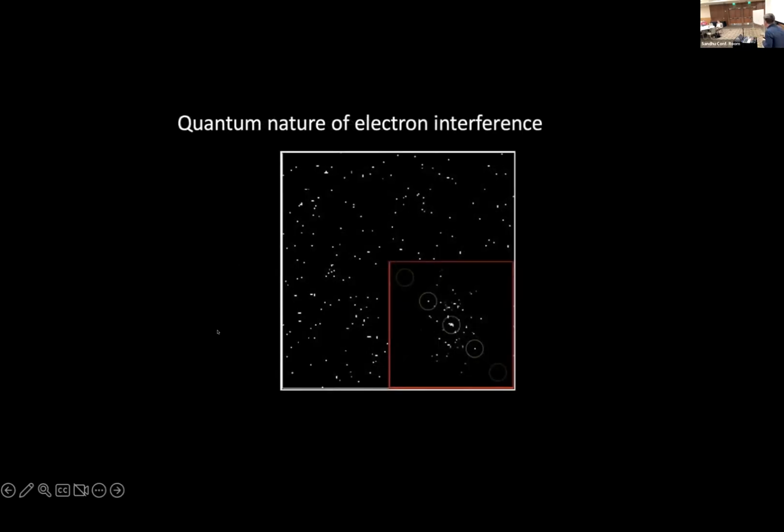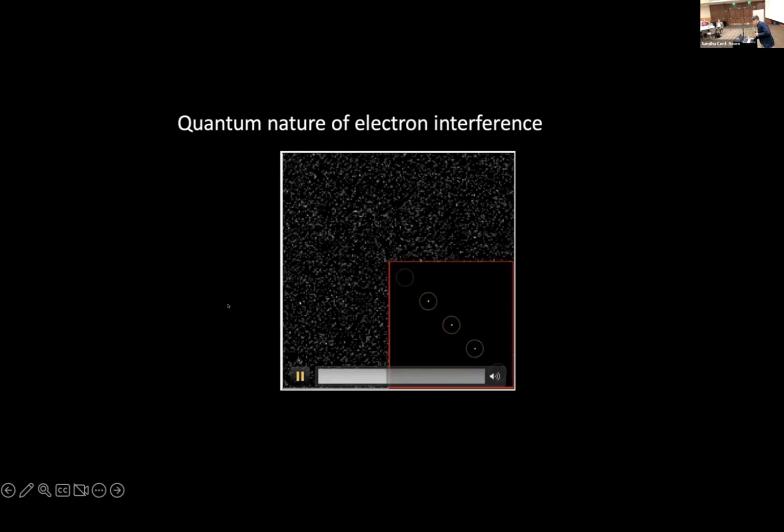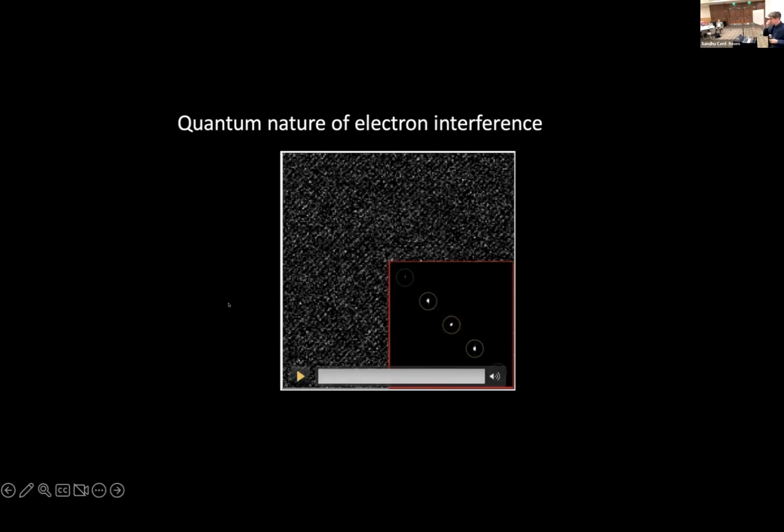Okay, now even when we only have a few electrons hitting our detector, there's still information there. So we can take a Fourier transform, and we see that in these particular areas, there's these persistent Fourier peaks. So there is some periodicity in even this kind of noisy image. Okay, so that's a direct image of interference fringes.